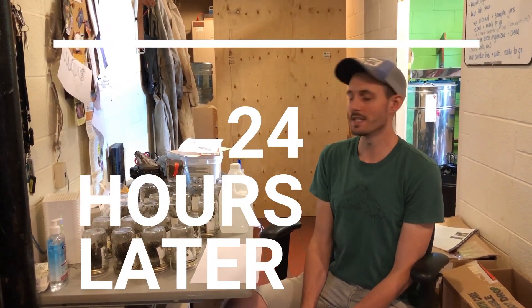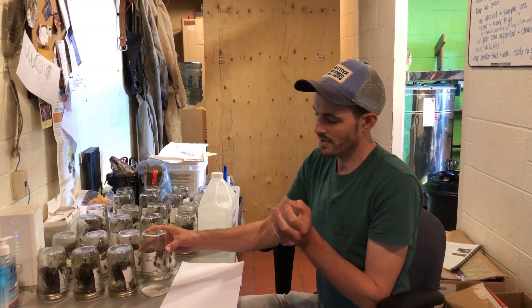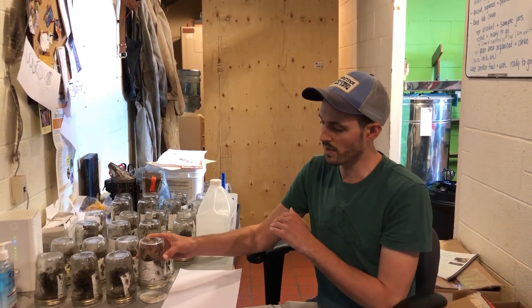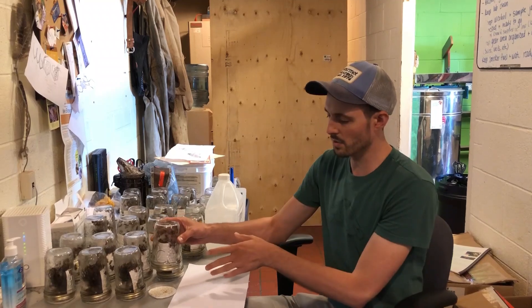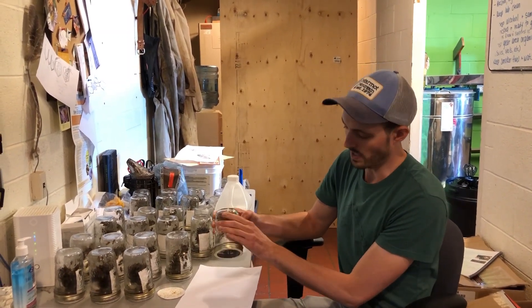It's been 24 hours since the bees have been in these jars. To do the final part of the Pettis test, we're going to pour in some alcohol and kill the bees to get the mites that are left over. Over this first 24 hours, all of the mites that came in contact with that strip and were hopefully killed would have fallen down onto the little sticky paper underneath. We're going to count that first. There might be some mites that are dead from the strip but still on the bee's body, so before pouring the alcohol in, we're going to bang the top of the jar two or three times to loosen any of those mites. We'll keep track of all the mites on the sticky paper as well as the ones that fall down from banging.